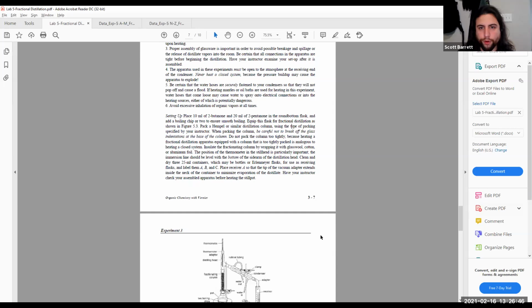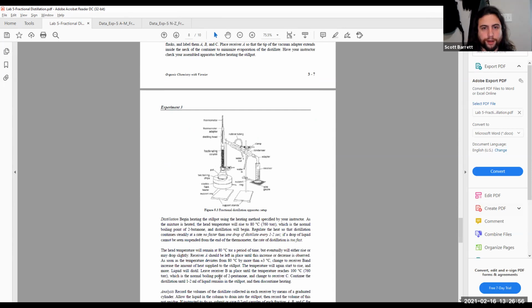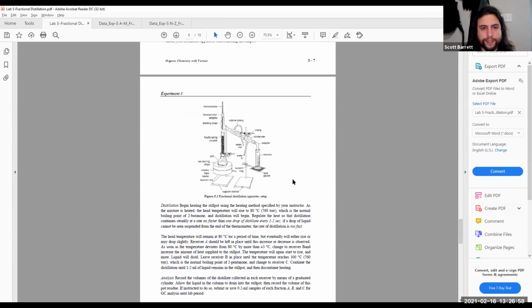So make sure to read through the full procedure and to follow these instructions when you're writing them, as if you are going to be performing this form of distillation within a lab setting. And so in here, we would go ahead and look at the scenario given here.